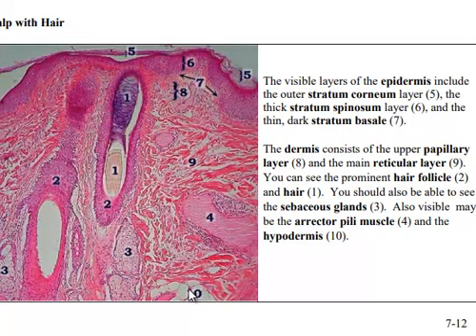It's kind of easy to see the hypodermis there because it's fat. Down here, the sebaceous glands are going to be a little bit of a challenge. But here they are. So again, there's the hair coming down the hair follicle, and you see this, which is associated with the hair follicle, which you can't see because you've cut the rest of the hair follicle away. But there's your sebaceous gland, and it kind of looks filled in as opposed to the sweat glands. The sweat glands are usually, because the liquid is clear, it looks like they're empty.